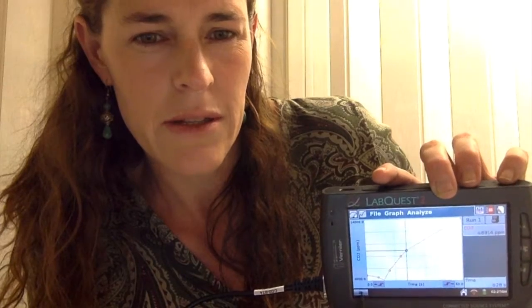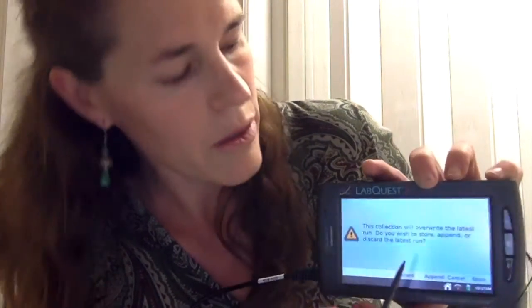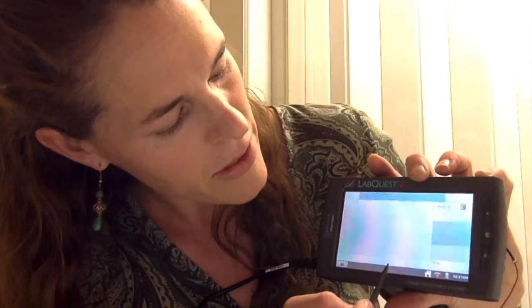Let's say we want to go again. It's asking whether you want to store it. Let's say we want to discard that one and do another one.